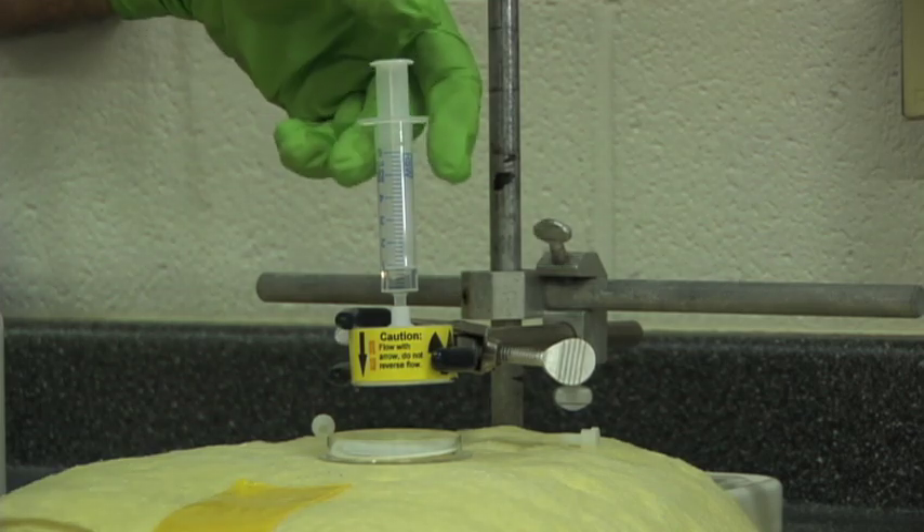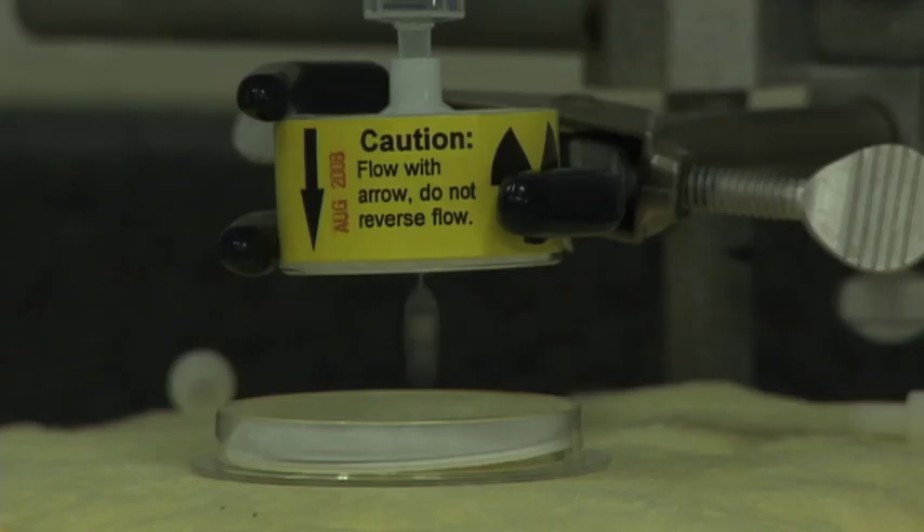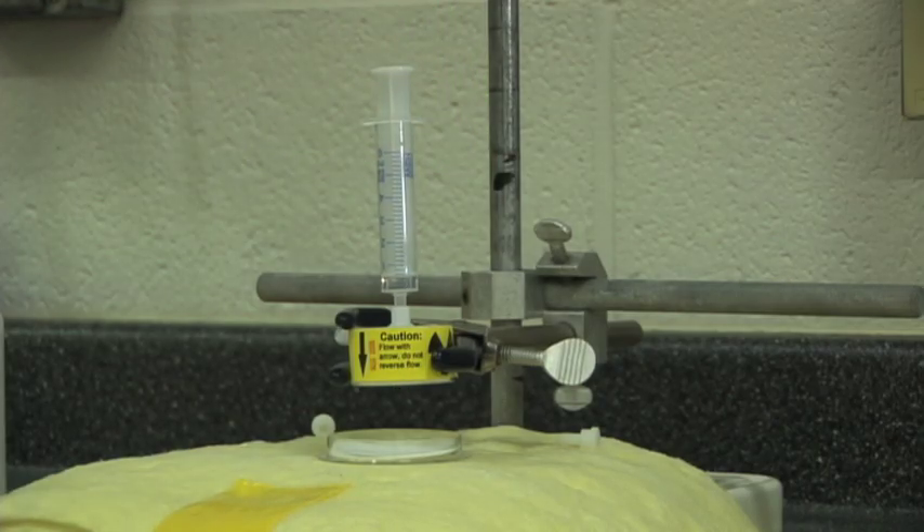So, how do you separate the barium from the cesium? Well, luckily, that's the easy part. Cesium and barium are chemically different from one another. We can easily separate the barium and cesium salts by using a solution of hydrochloric acid and sodium chloride. We simply wash the solution through the generator and the barium is eluted out.